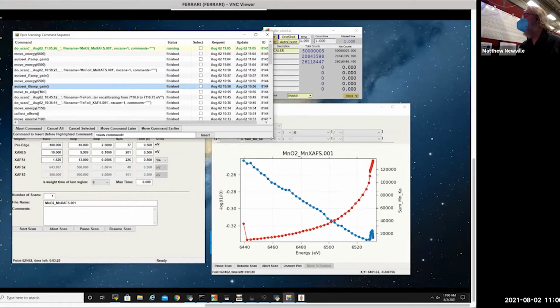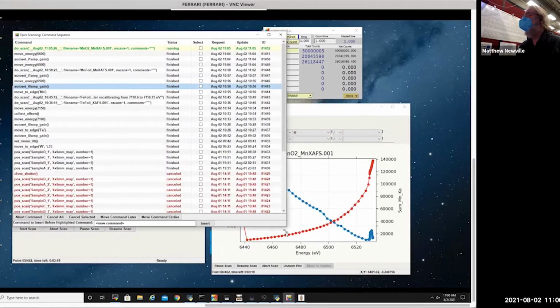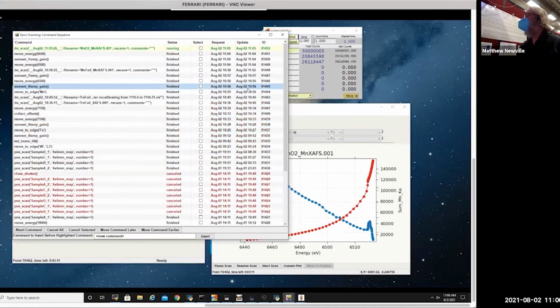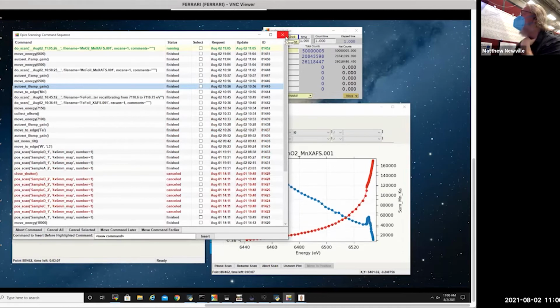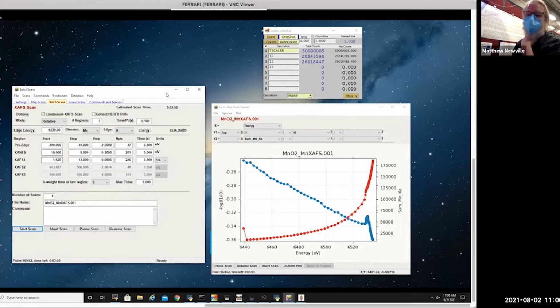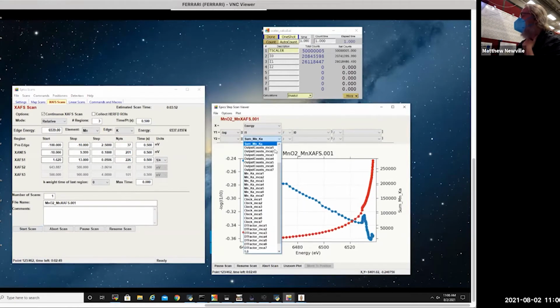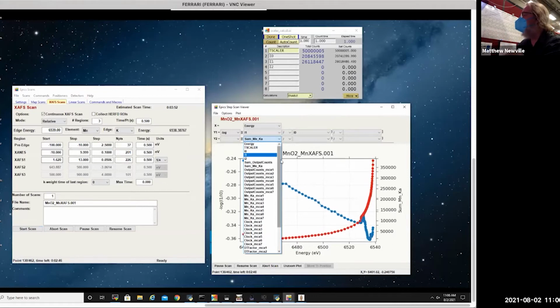The stuff I did overnight is here, going back a day or so, for all of the commands that were done. And you can build up a big queue of these and run overnight. Yeah, anyway, and there's even a little bit of documentation, slightly. For the people that come to our PMLab, we also have some videos on this and we go over all of this as we're starting. But this will vary for every beamline, so I wouldn't get too focused on that.